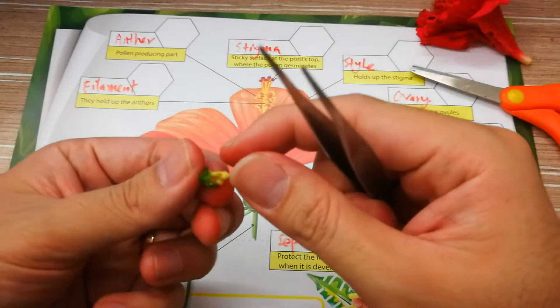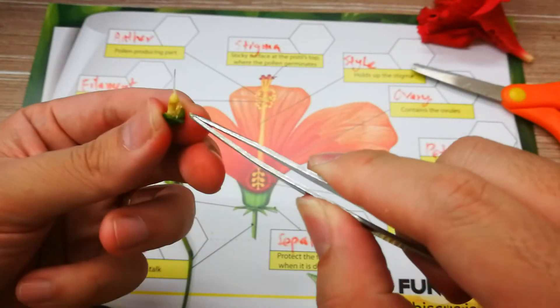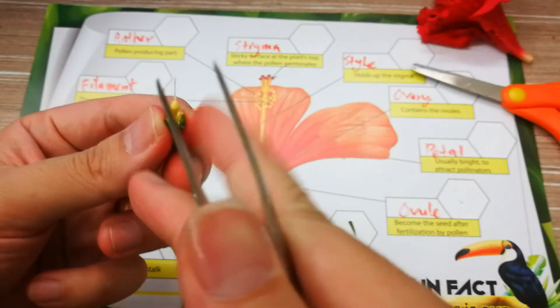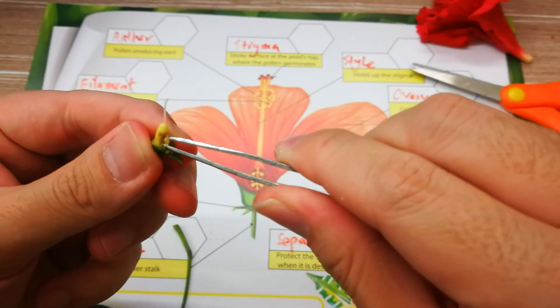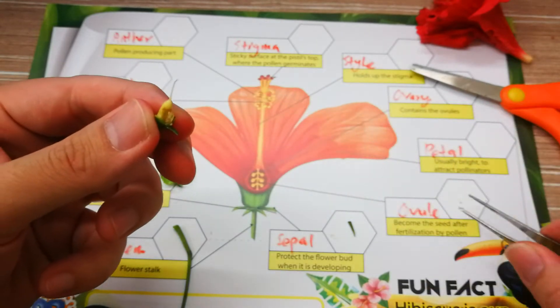The ovule will be hidden inside. You need to cut it open and take out the ovule gently. There's a lot of it, okay, then put this on here.